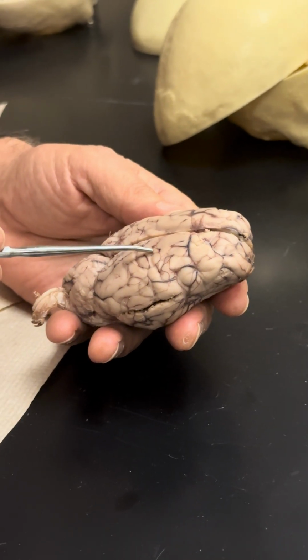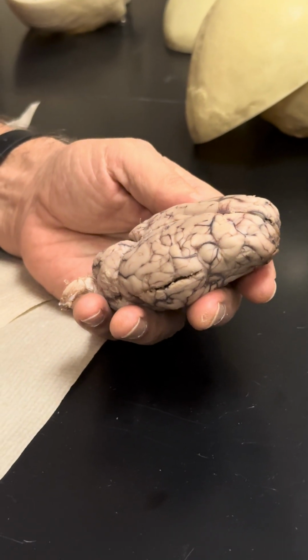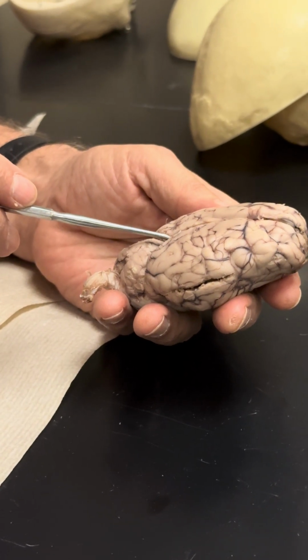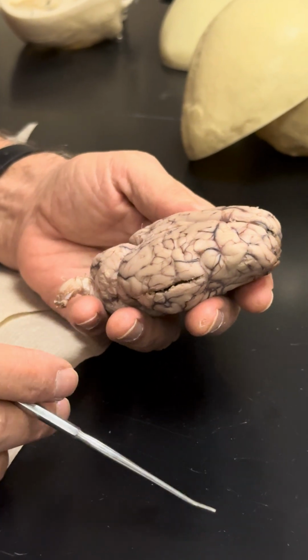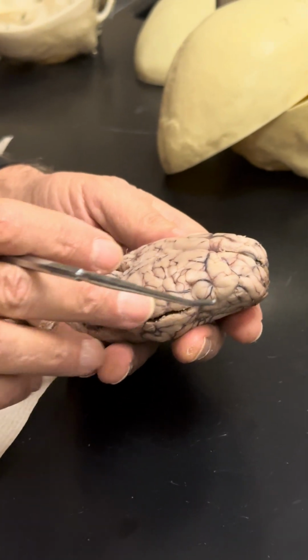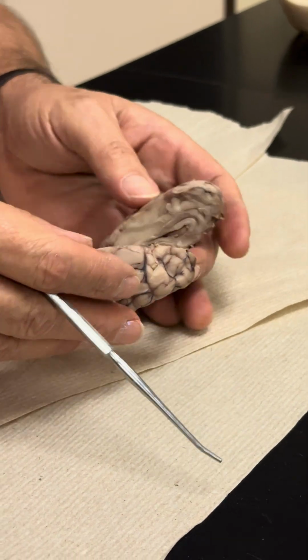Gyrus. Every ditch between is called a sulcus. The division between right and left cerebral hemispheres is called the longitudinal fissure. Longitudinal fissure. It goes down to the corpus callosum.